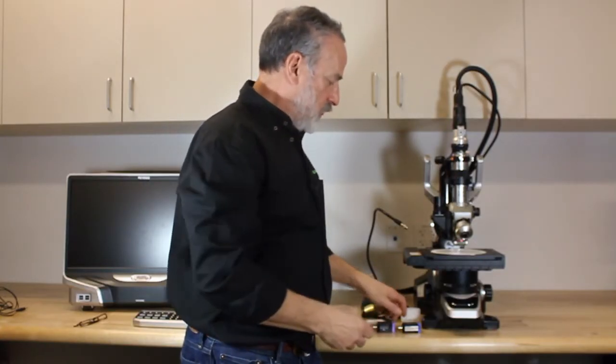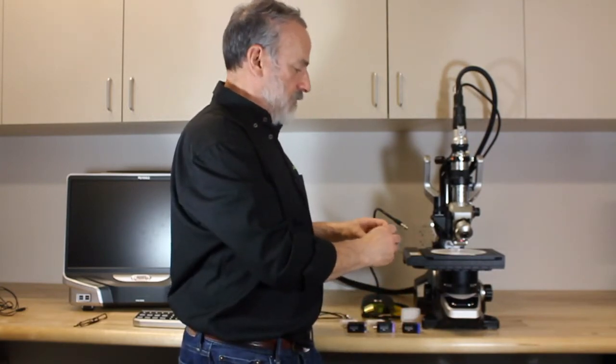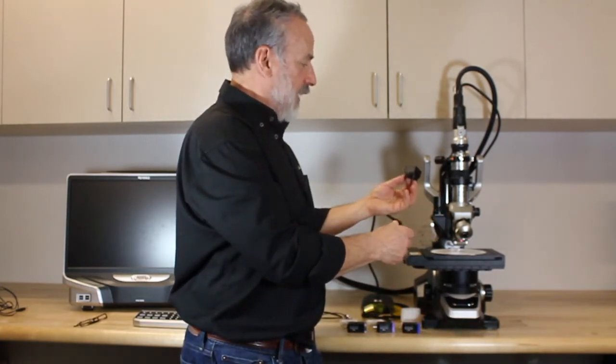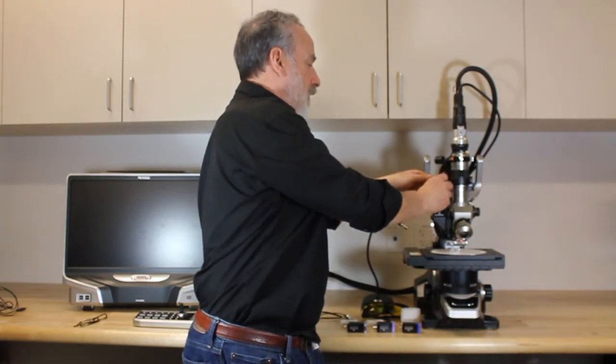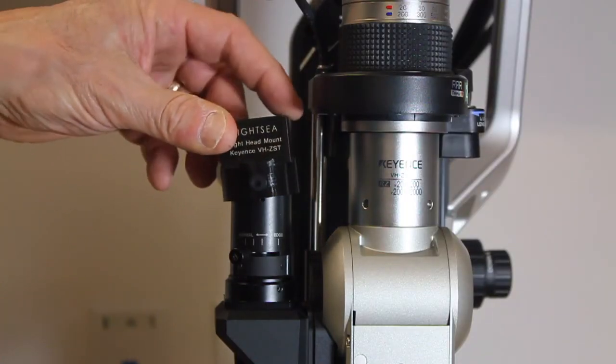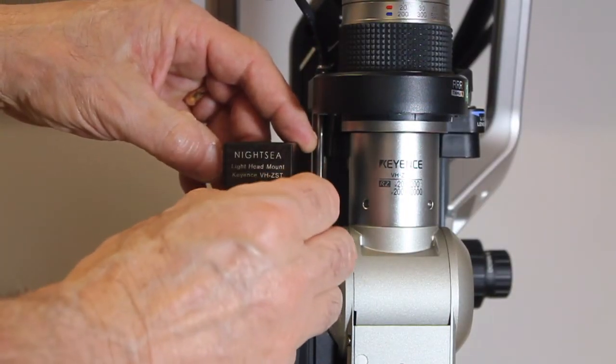In order to put the light source over the fiber input, we have a custom mount that just slips on over there and pushes down and just secure it very lightly with a thumb screw.